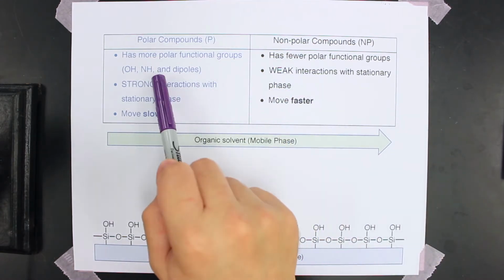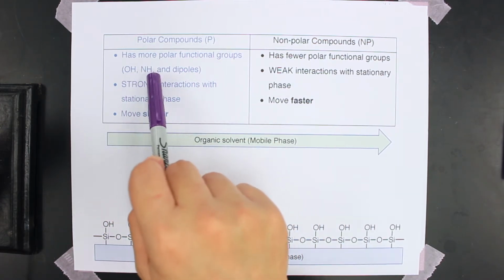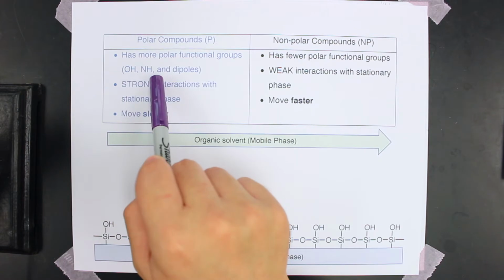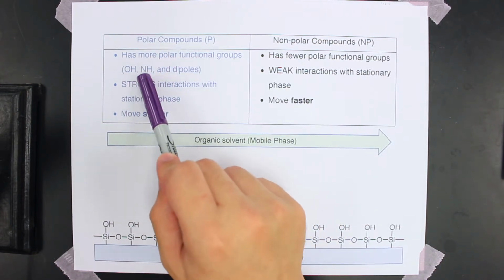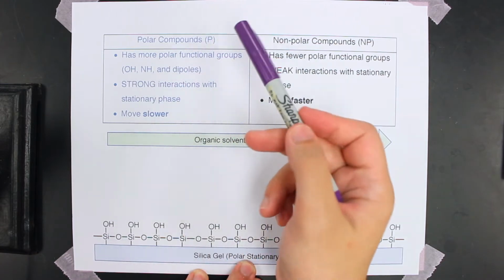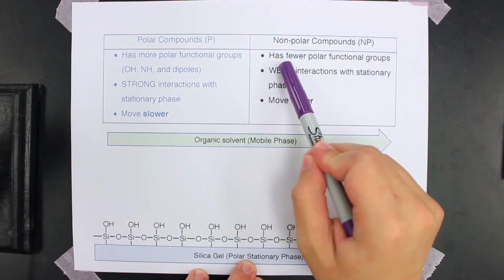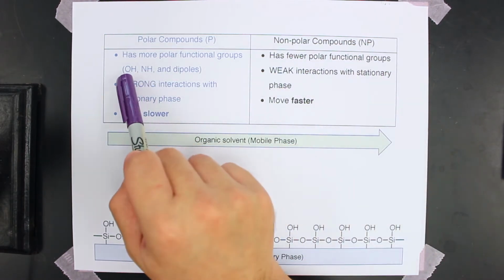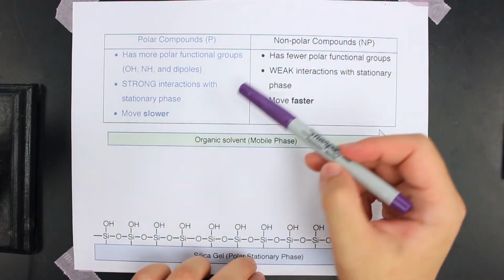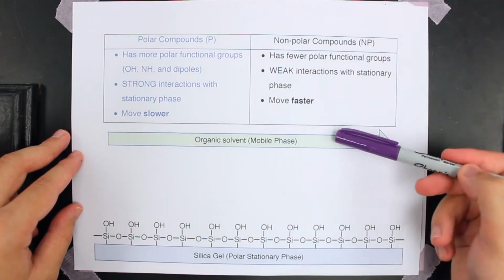So if we have a polar molecule, as we went over in previous labs, these molecules have more OH, NH groups and dipoles. So these are the functional groups that are polar and make them more hydrophilic. They're more water-loving. In contrast, a nonpolar compound will have fewer of these polar functional groups, so less OH, NH, and dipoles. Now, as far as these go, in chromatography, we have this little diagram here.